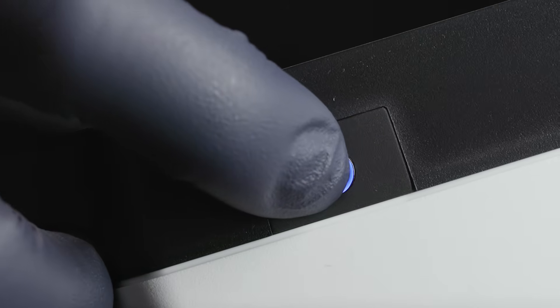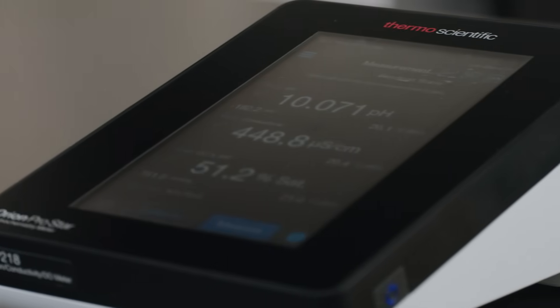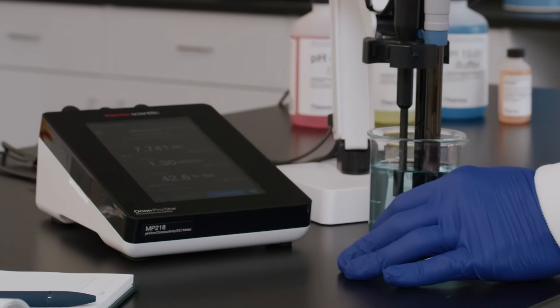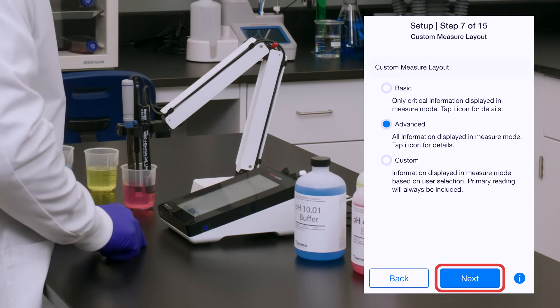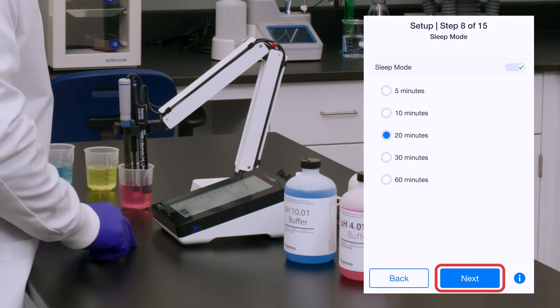From the first push of a button, every detail of the Orion ProStar is designed to help make your job easy. The Setup Wizard guides you through important settings and configurations, making first-time meter startup a breeze.